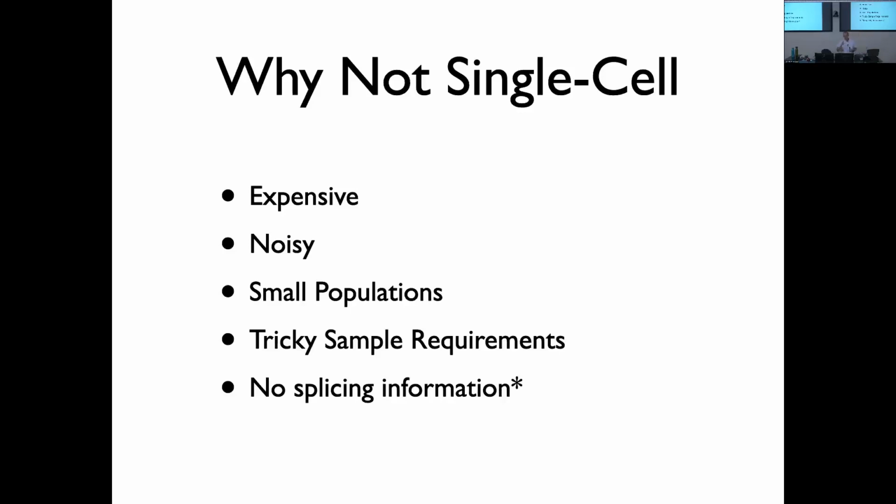Now, that $2,000 per sample depends on, you get a multi-sample discount, right? So if you have 8, and the numbers might have changed since last time I looked at this, it's a lot more expensive to do single cell. It is noisy for at least 2 reasons.